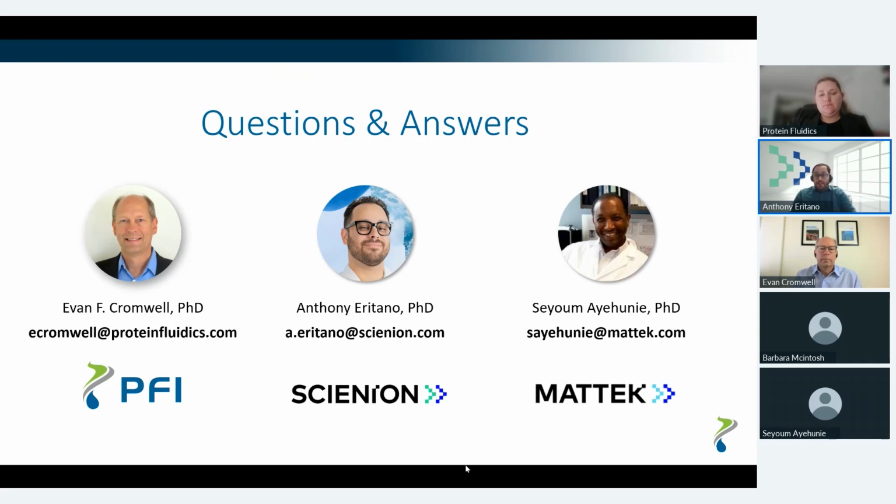Yes. Between the work we do here in the U.S. and our collaborating staff in Lyon, we have isolated many different types of tumoroids and organoids. We've isolated mouse organoids, lung organoids, kidney ducts from mouse, pancreas duct from human, gut, and IPS-derived brain from mouse and human, in addition to human liver organoids.